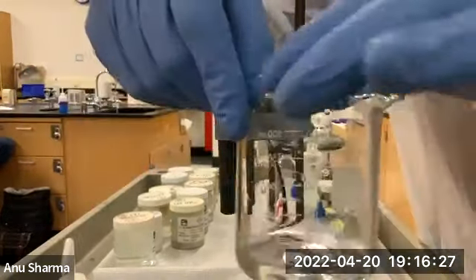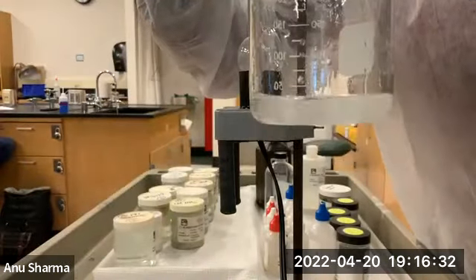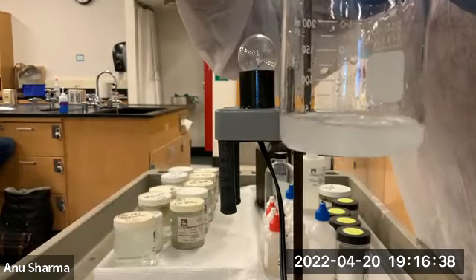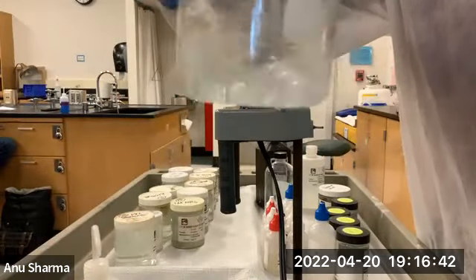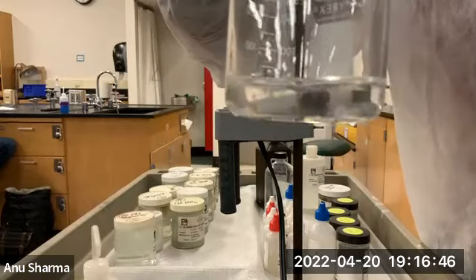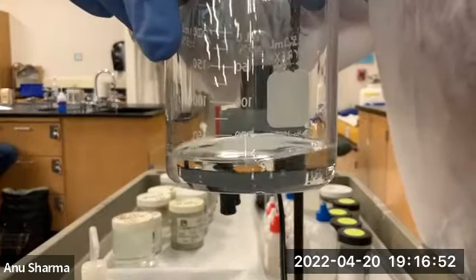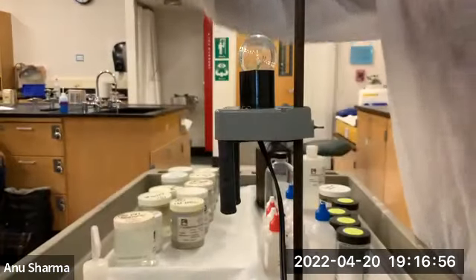Here's the water I'm adding. And yes, the OH and the water molecule hydrogen bond. You see a little bit of bubbling and turbidity, but in the end, it's a nice clear solution because C2H5OH has an OH which hydrogen bonds with the water.